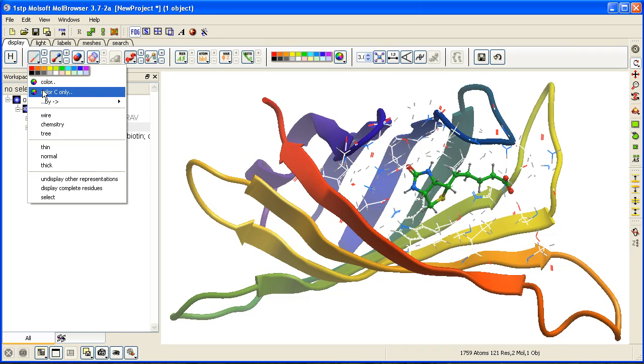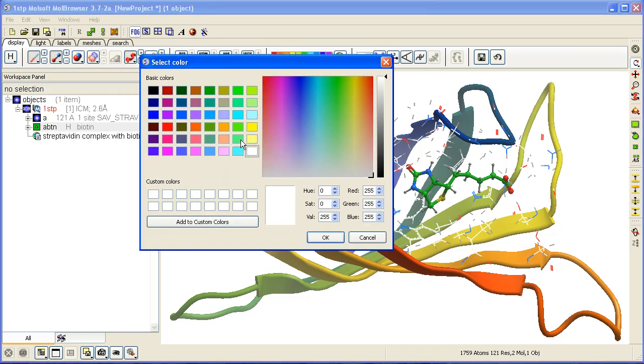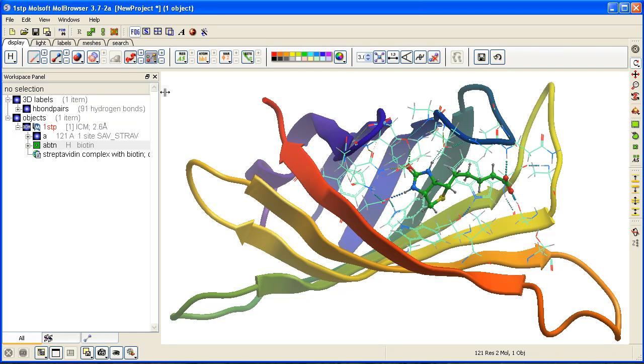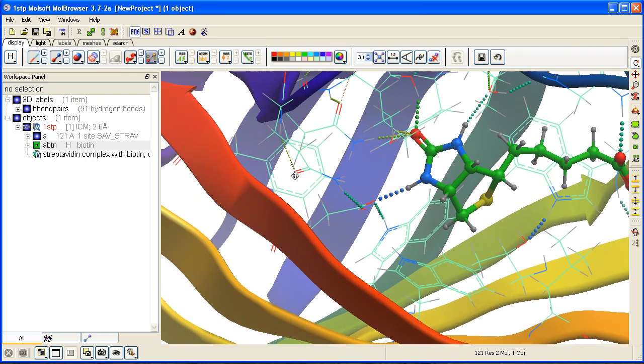To display hydrogen bonds, click on the display hydrogen bond button here. If we zoom in, you can see the hydrogen bonds displayed.